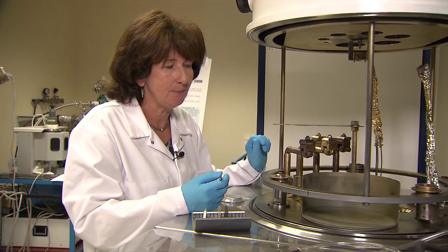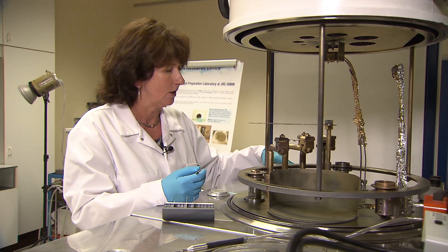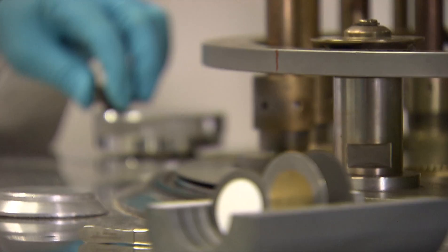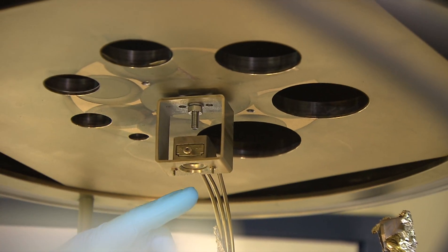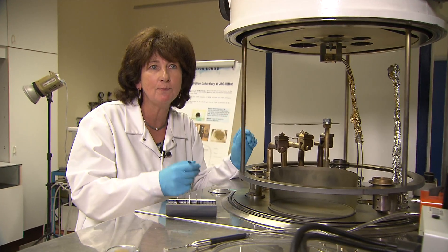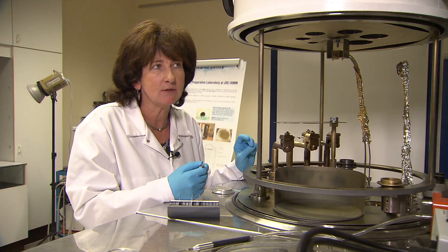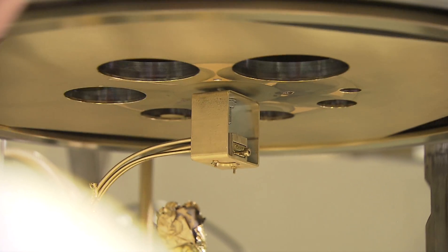The material is heated up, and from a certain temperature above 1000 degrees Celsius the shutter is opened and the gold flux is deposited on the backings that are mounted in a carousel. This carousel is turning around during the complete evaporation process to improve the homogeneity of the layer, and the thickness of the deposited material is monitored by a thickness monitor, which is a quartz crystal.